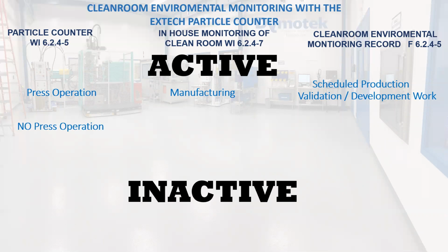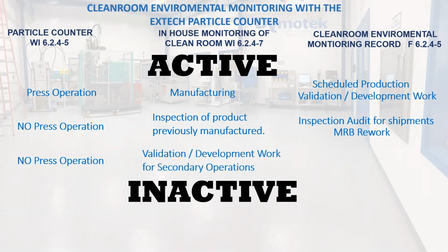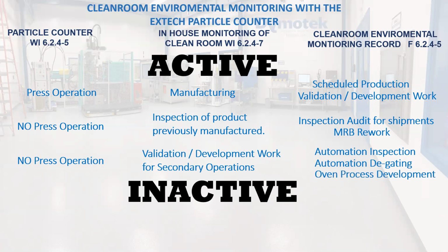Even when there is no press operation, if there is inspection of previously manufactured product, such as inspection audits for shipments or MRB rework, the room is considered to be active. The room is also considered to be active if there is no press operations, but there is still validation and development work for secondary operations, such as automated inspection, automated degating, or oven process development.